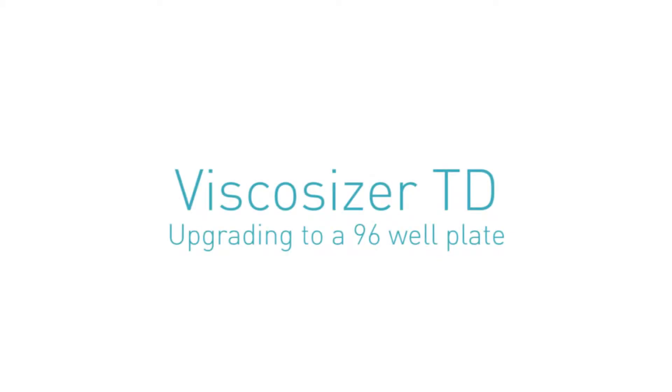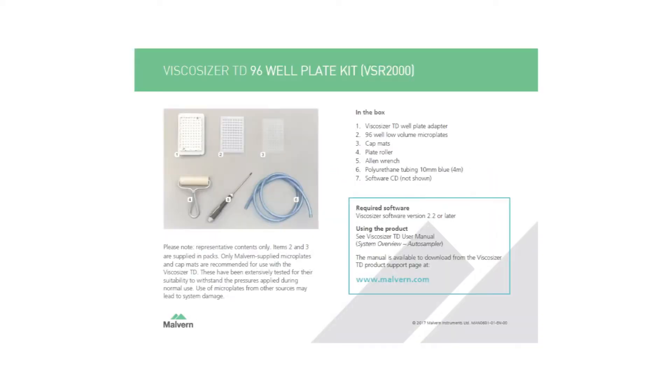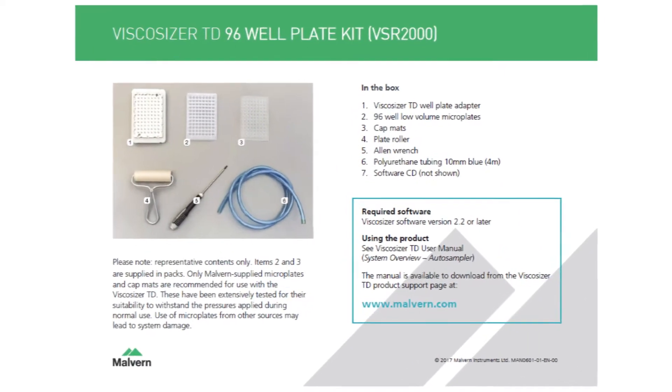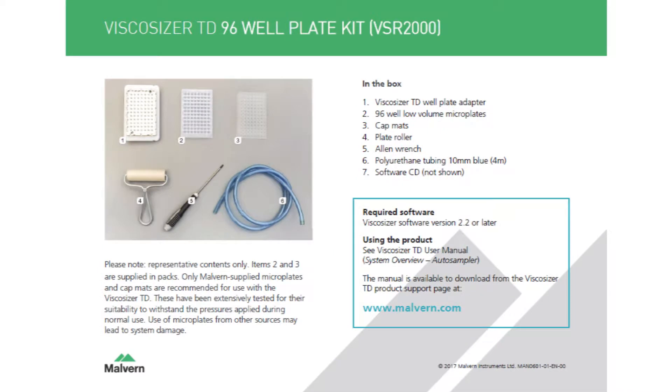Welcome to the Viscosizer TD Upgrading to a 96 Well Plate Tutorial. The 96 Well Plate Upgrade Kit can be purchased from the Malvern web and contains the following.